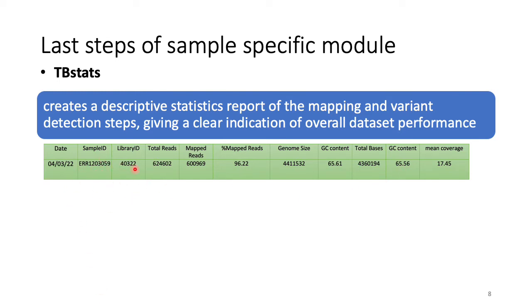So you can see that we have 96% mapped reads, and the GC content also is similar to our reference genome. As I presented to you in previous webinars, the GC content is an important indication to see if you really sequenced the bacterial species that you wish to sequence, or you have some contamination.